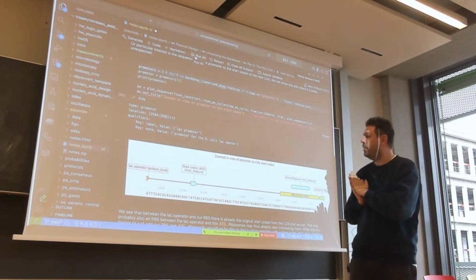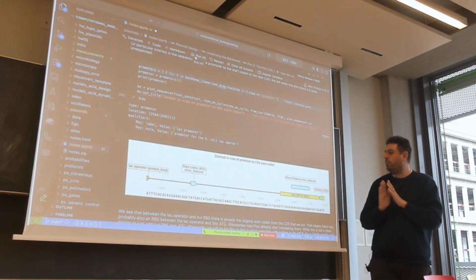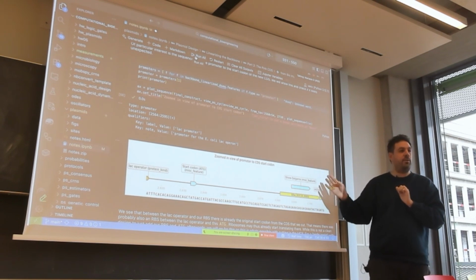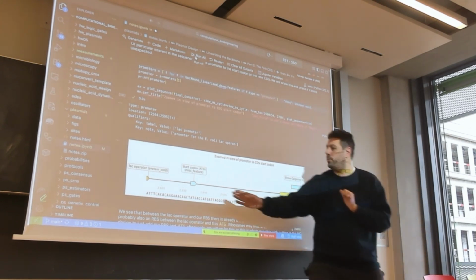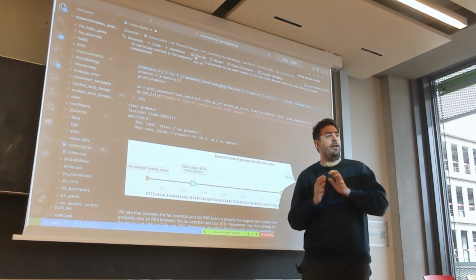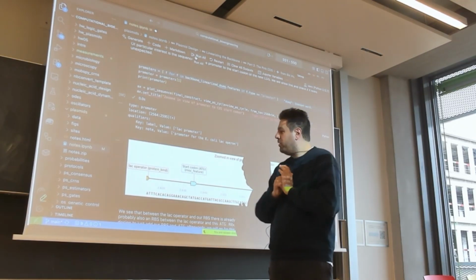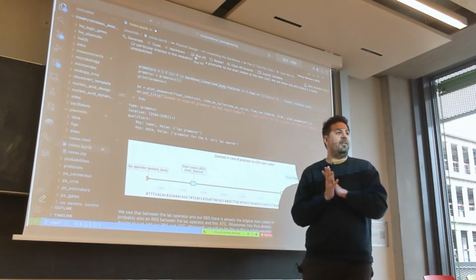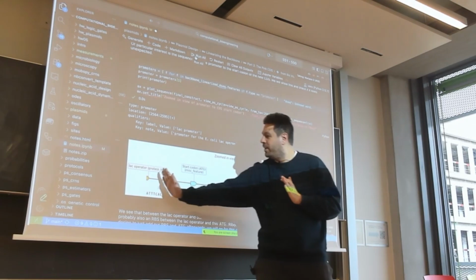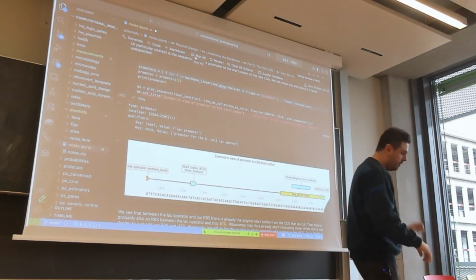I don't want to say too much about it, but the reason why we did it was we wanted to cut with an enzyme in the MCS sequence, and that was not present here. So there is no cutting here. But there is another technique, not to cut with enzymes but to cut with PCR, and you will do a very clean design in the problem session. So you will go exactly from here to the left, and then you don't have this problem.